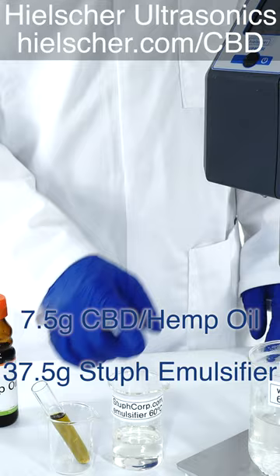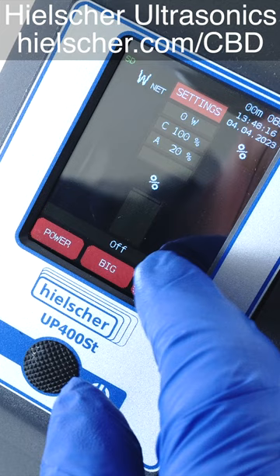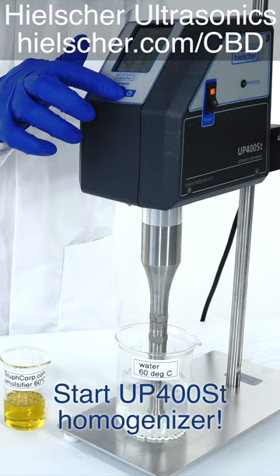First, we add the CBD hemp oil to the StuffCorp emulsifier. Then, we start the UP400ST sonication and slowly add the mix to the water. The emulsion turns translucent very quickly.